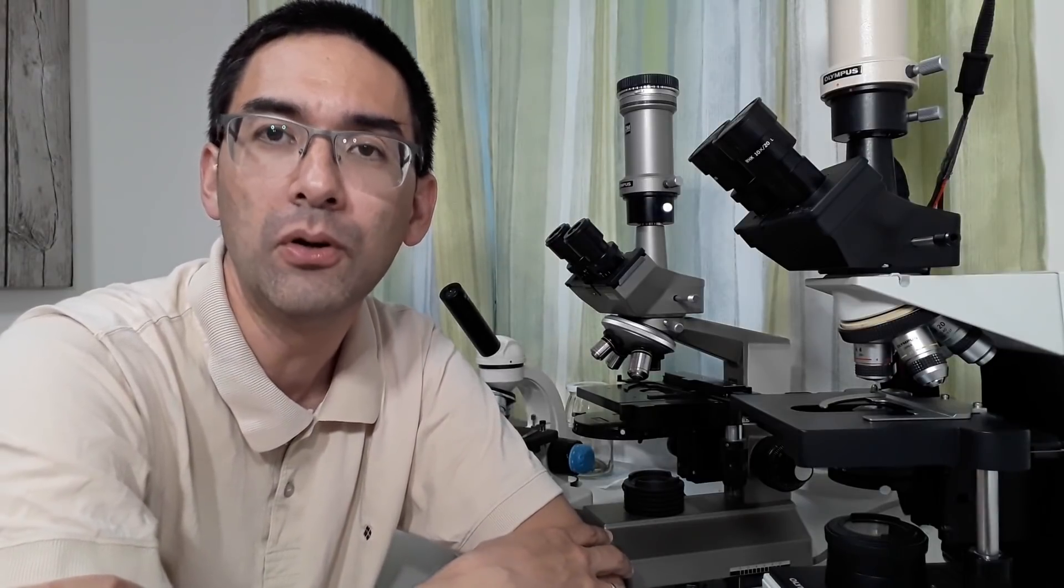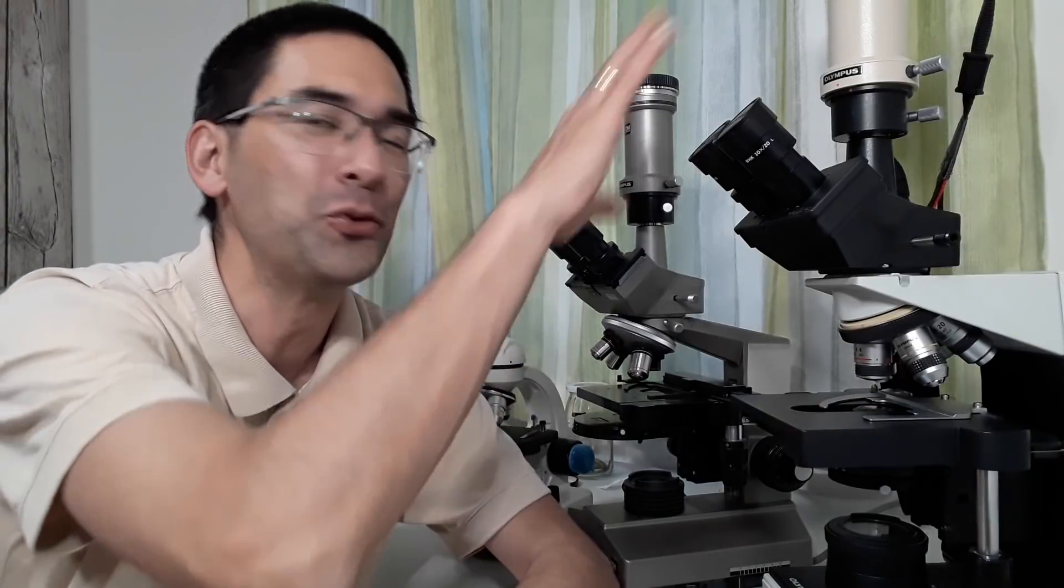And my advice is also, if you're serious about amateur microscopy, then also get yourself one where you can take pictures. So with a photo tube, like they have here. I think the ability to take pictures is a very important thing because it allows you much easier to document the things that you're actually observing. If you don't have a photo tube, then you can still always take pictures through the directly through the eyepiece using a pocket camera or mobile phone. This also works.